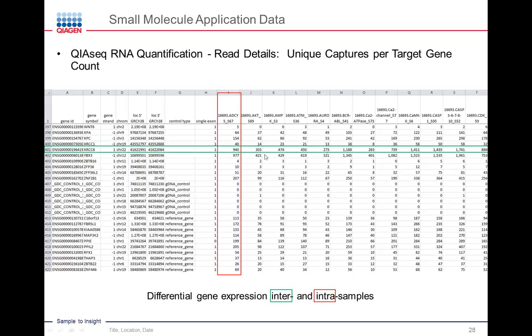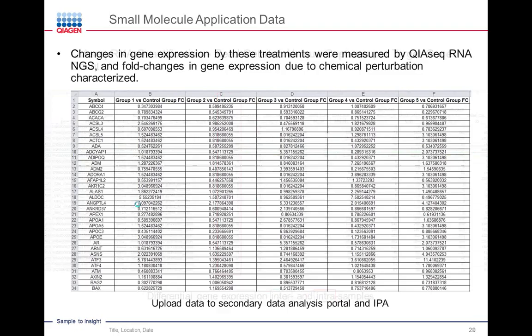What we can do also is compare all the different samples for the same gene. So instead of looking at 421 genes across the same sample, we'll be able to compare, let's say, the XRCC6 gene across the 96 samples that we have analyzed. And you can clearly see how that same gene is differentially expressed across the different samples, indicating that the perturbation of specific pathways will lead to the differential expression of this gene across the different samples.